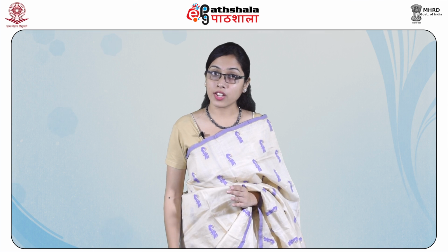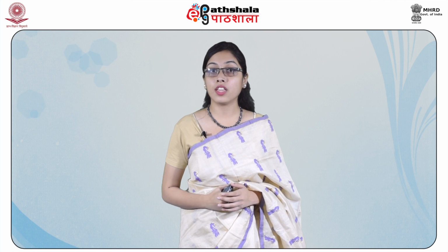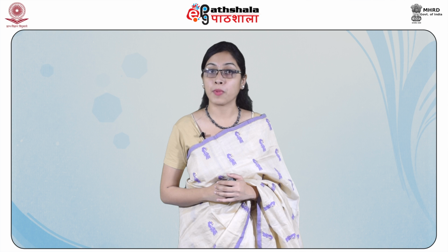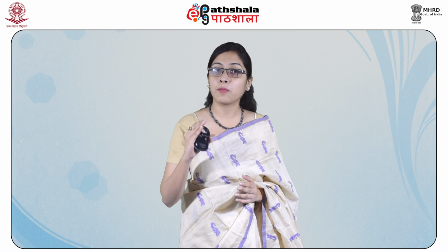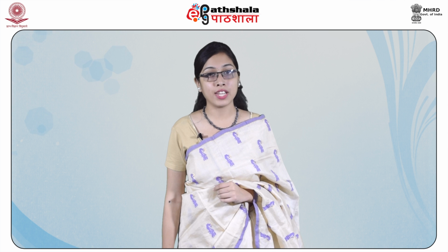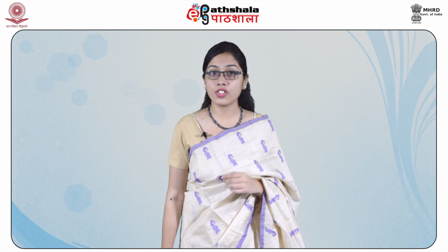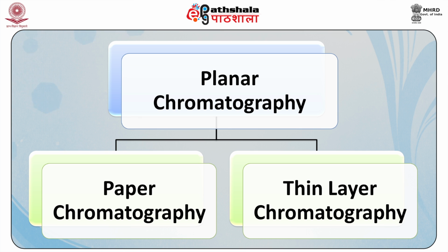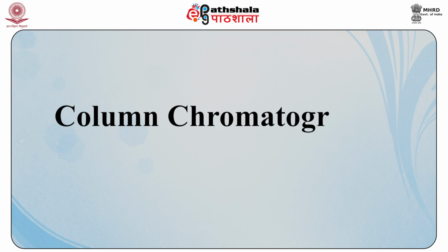Planar chromatography: in this type, the stationary phase is supported on the fibers of a paper or on a flat plate, whereas the mobile phase flows or moves by capillary action or under the influence of gravity through the stationary phase. The two major types of planar chromatography in use are paper chromatography and thin layer chromatography, also known as TLC. Next is column chromatography.